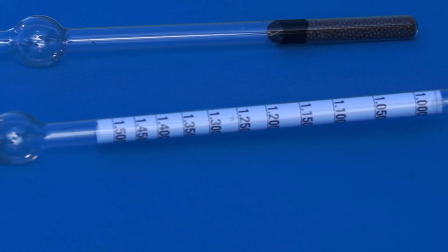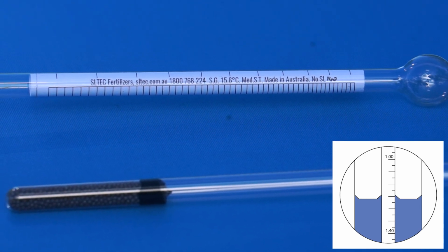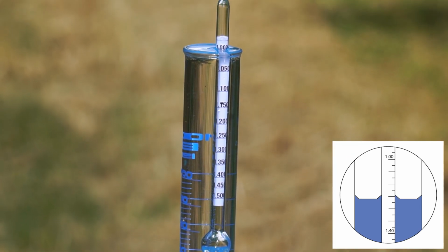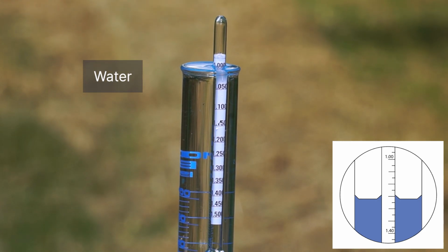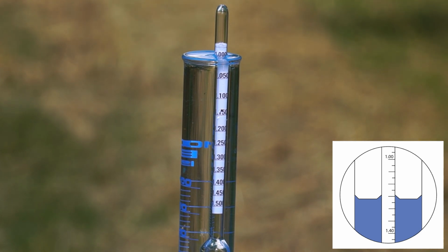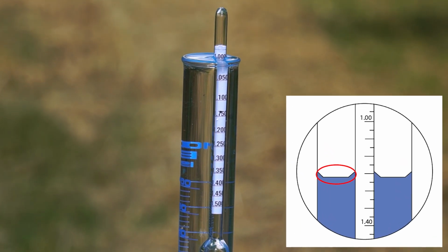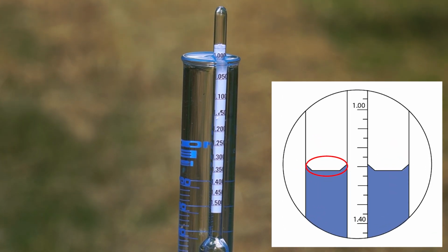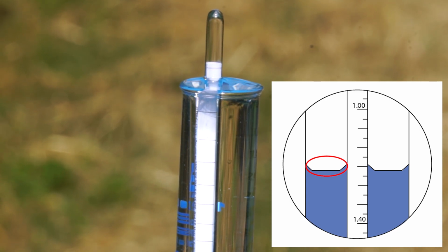A hydrometer is a glass cylinder that has been calibrated to measure specific gravity of liquids, with water as a reference. When we float a hydrometer in water, we can see that the SG is 1. It's important to note that hydrometer readings are taken from the bottom of the meniscus, which is the dip in the liquid surface that forms as the liquid is attracted to the glass wall of the measuring cylinder and the glass wall of the hydrometer.